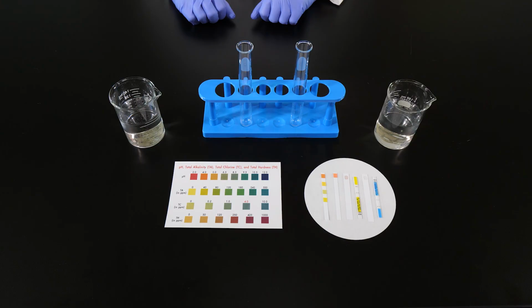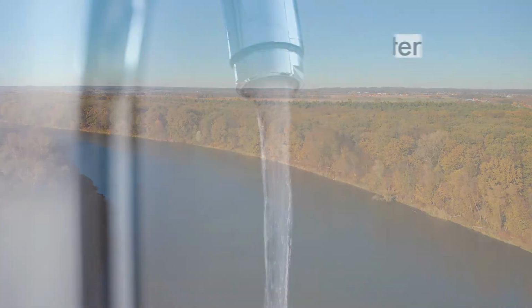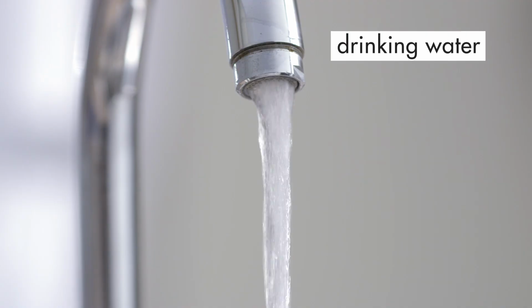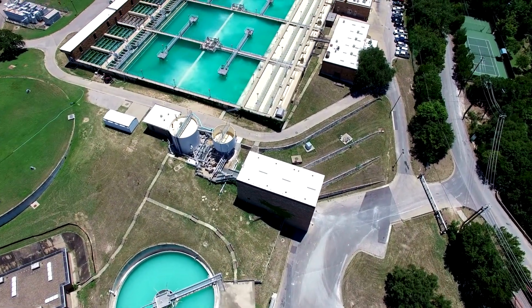In this lab, we will perform water quality tests to determine the contaminants in 2 water samples. One sample is from the river that is the source for our drinking water. The other sample is from our local water system. This water comes from the same source, the river, but it has been treated at a water treatment facility to make it safer for drinking.